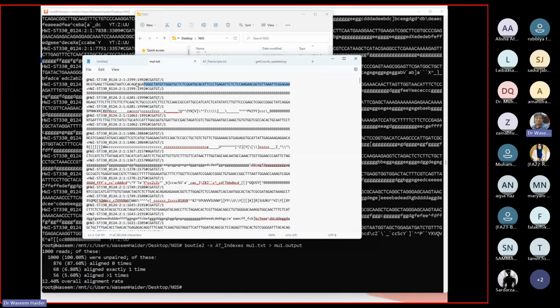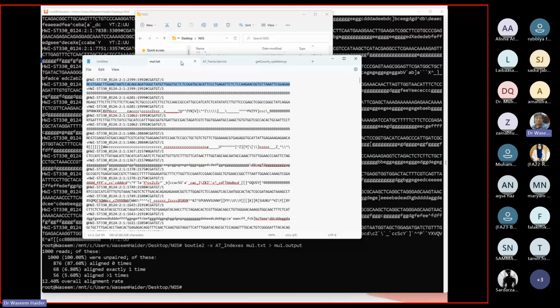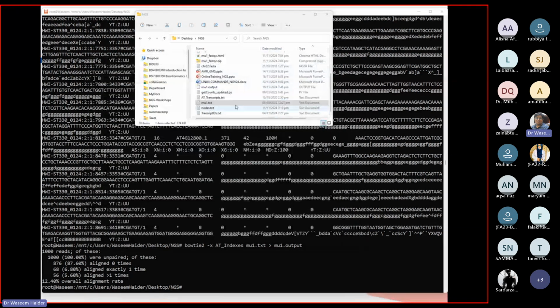It will take the reverse complement of this fragment, and it will also take the reverse complements of all those transcripts, and those reverse complemented transcripts were used to form their index files. So it will take those reads, reverse them, and map them with these rev, or reverse index, files, these two files. And then we can have them, right?